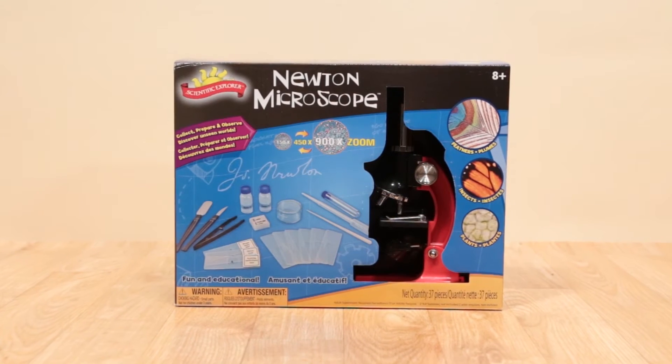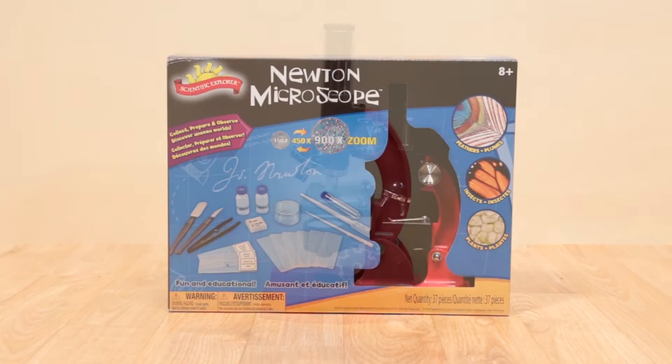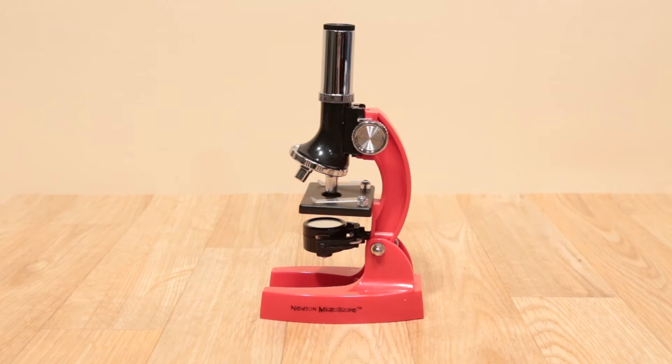Collect, prepare, and observe. Zoom in and discover unseen worlds with the Newton Microscope from Scientific Explorer.